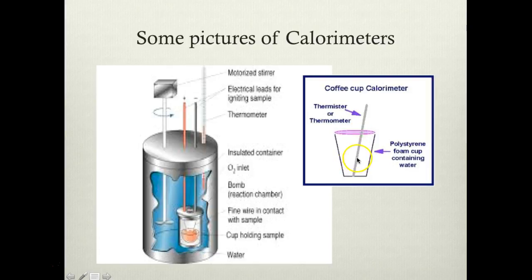And then as the reaction proceeds and the heat is generated, you will see that the initial temperature, which was at room temperature, approximately about 21 or 22 degrees centigrade, is gradually rising as a result of the heat evolved out of this reaction. All right. So again, you will then plug it into an equation to calculate the heat generated from that reaction. This same principle is done in a more sophisticated instrument called the bomb calorimeter.